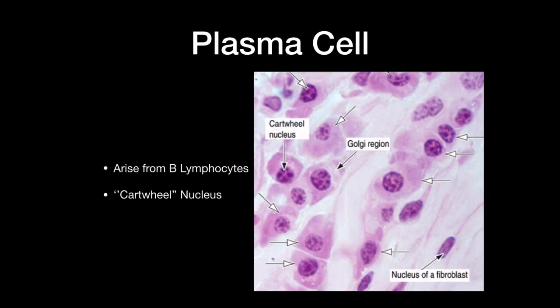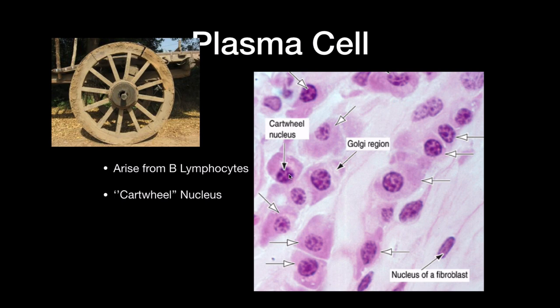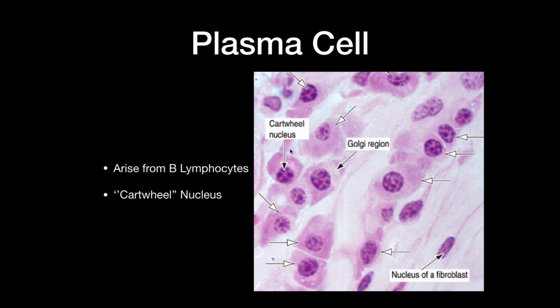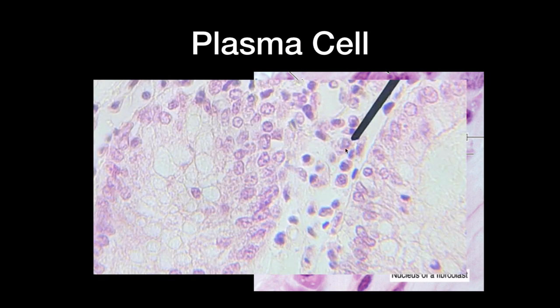Plasma cells arise from B-lymphocytes. When a macrophage presents an antigen, it triggers a cascade: B-lymphocytes are presented the antigen, which causes them to produce plasma cells. The plasma cell then synthesizes antibodies against that antigen. Under the microscope, the plasma cell has a distinctive cartwheel nucleus — the nucleus literally looks like a cartwheel, with the nucleolus and euchromatin in the middle and a large cytoplasm. The center of the nucleus is light and the edges are darker.